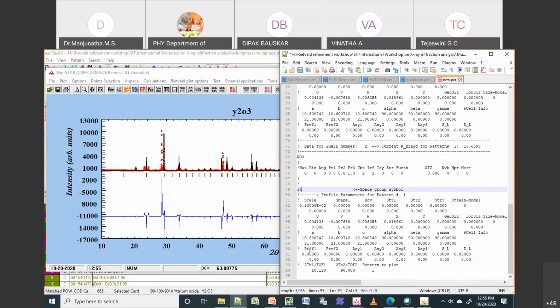Accordingly, this is monoclinic, so I have to change these ABC values, alpha, beta, gamma. These are the starting values. As I have used 1 and 2, I have to change this to 3. This is 4. This is 5, and also beta will be 6. Okay, so this is 5. Beta will also change, so I'll just keep 60.